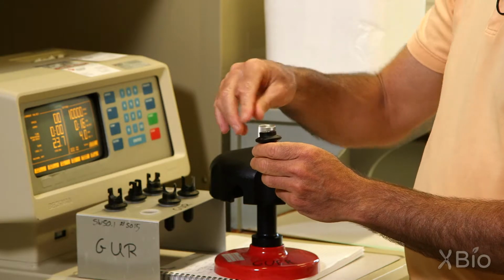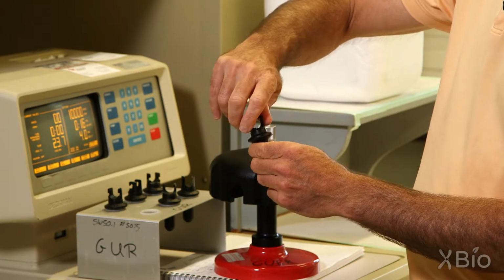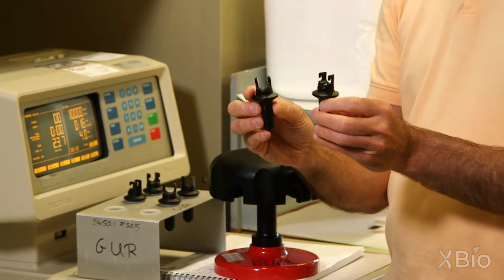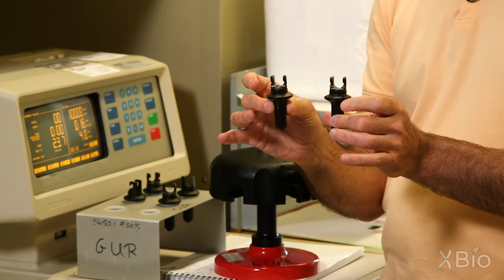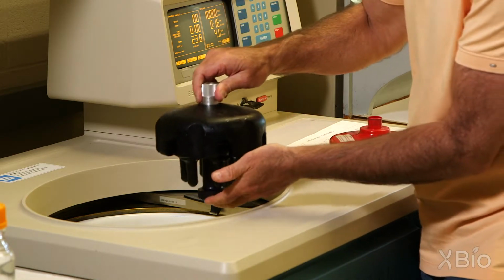So here I'm going to put our sample in the bucket here. And it's very important that you have a counterweight. In fact, these two buckets have to be very carefully weighed so the rotor doesn't become imbalanced. I'm going to put it now inside the centrifuge.